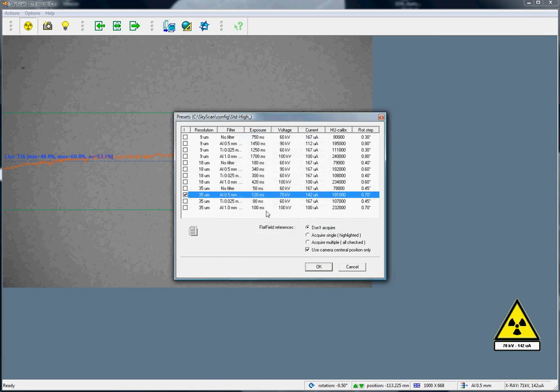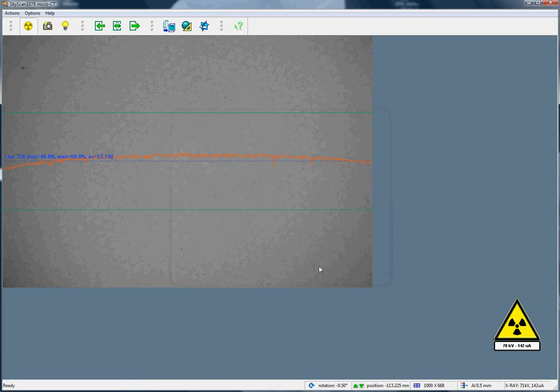So, the exposure time now has been changed to an appropriate value. One thing that's very important now is to retake the flat field correction.